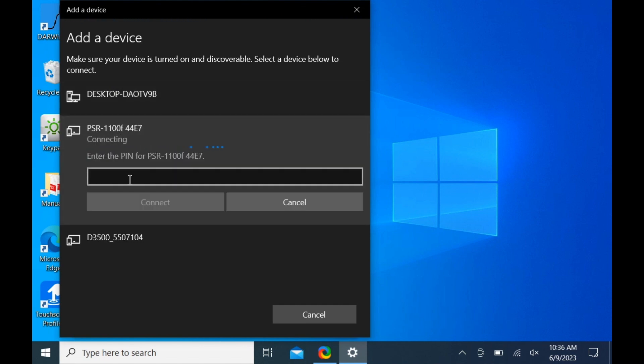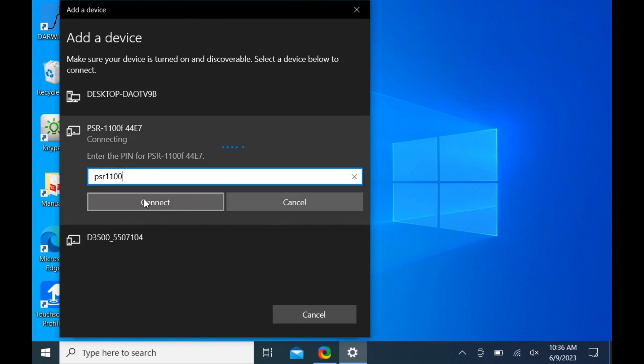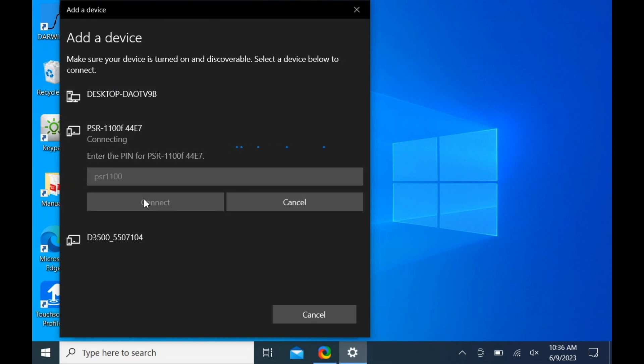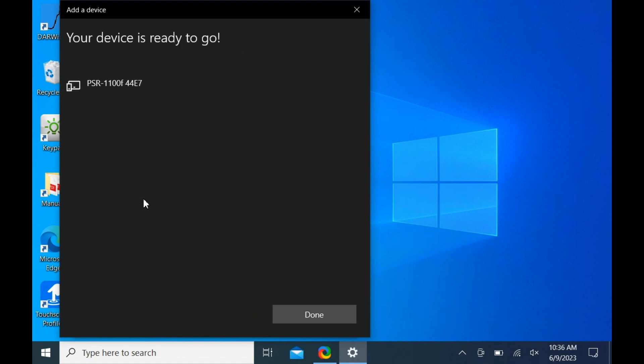In the pin field, enter the device password provided in the user manual. It is typically the model of the system in lowercase without hyphens. Then click connect. Click done.